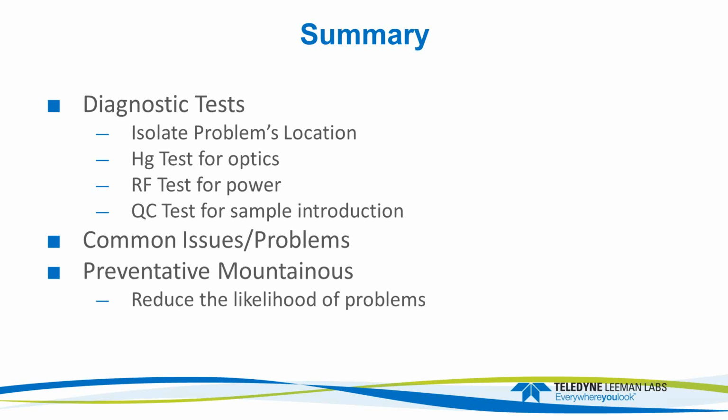Reduce the likelihood of problems that you have. If you do that preventative maintenance, then you will reduce the amount of time you spend troubleshooting. So you get more samples run through the system, and you'll spend less time being frustrated and trying to tame the instrument in your lab.